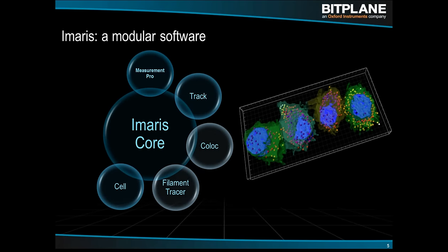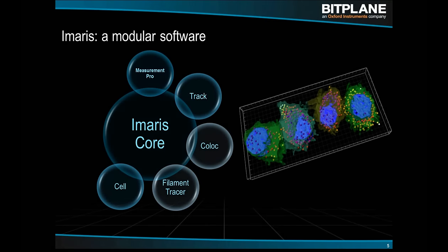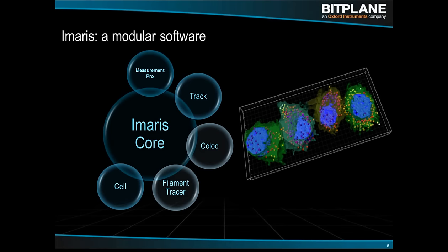And then when you do this multi-compartment type of analysis, you can start extracting information, one, about relationships between the different compartments in the cell, different subcellular components, having to do with how far are the vesicles from the plasma membrane or from the nuclear membrane or the center of the cell, et cetera. And also, it provides a more convenient way if you have a field of view containing multiple cells. The segmentation algorithms are going to separate the results on a per cell basis.